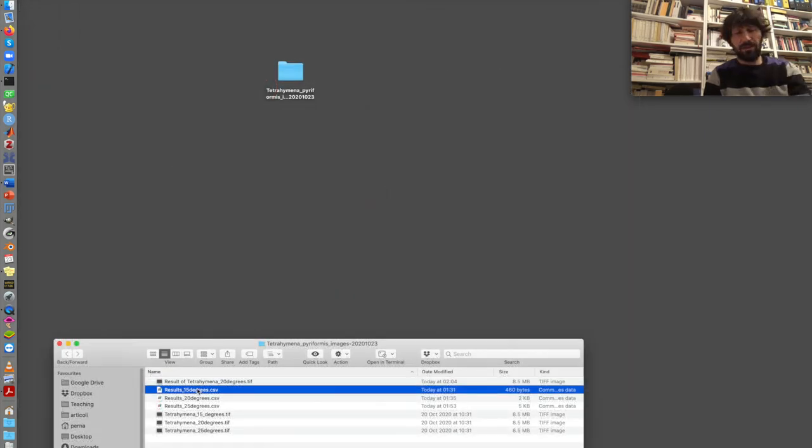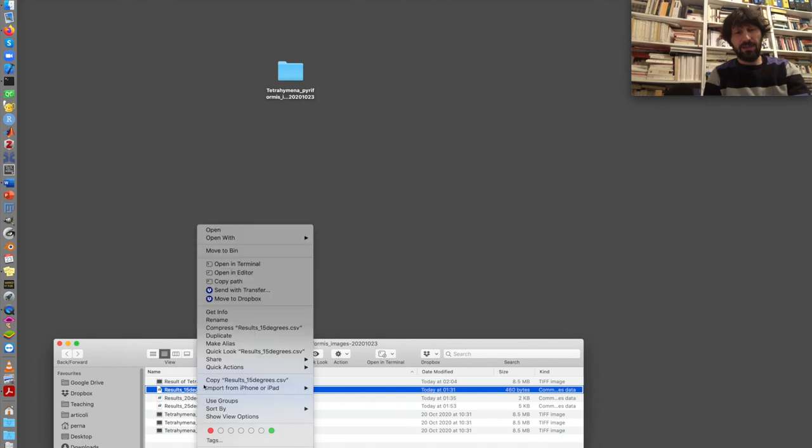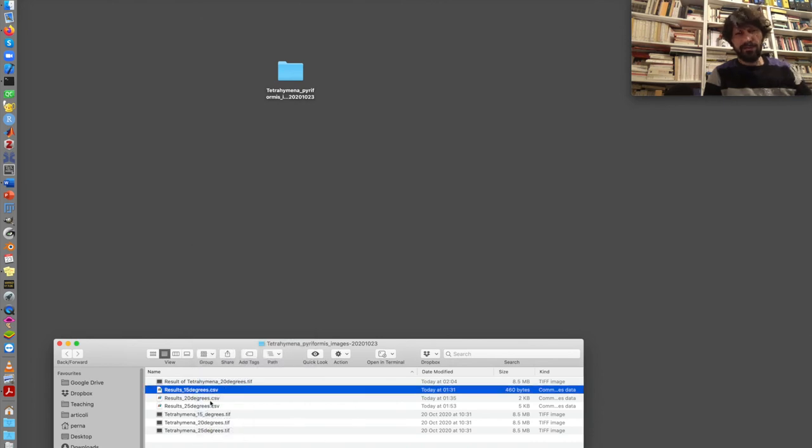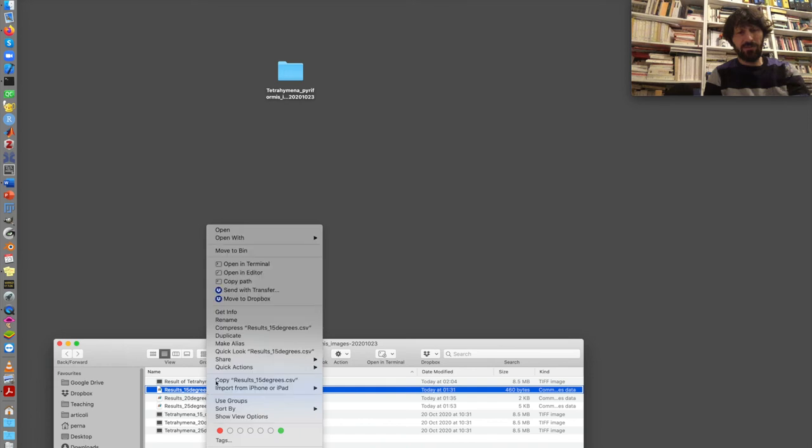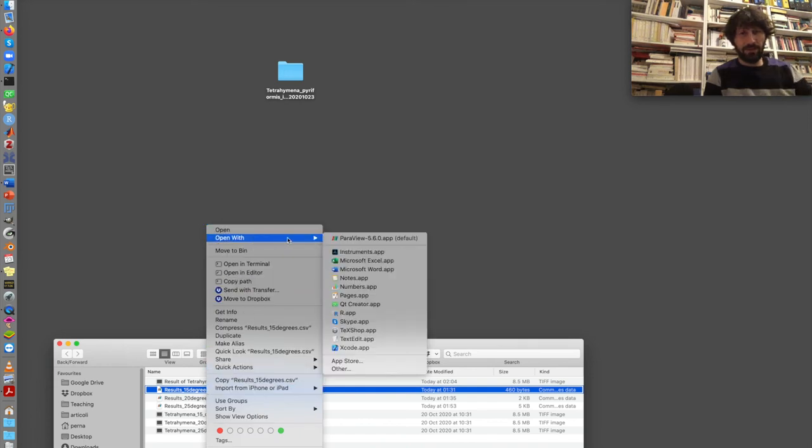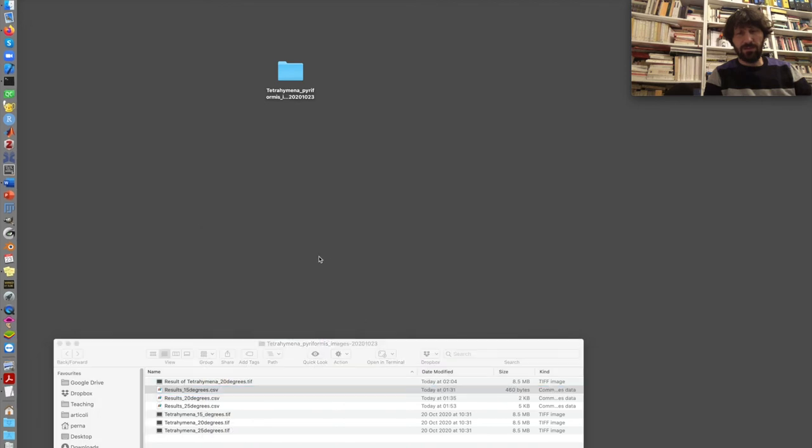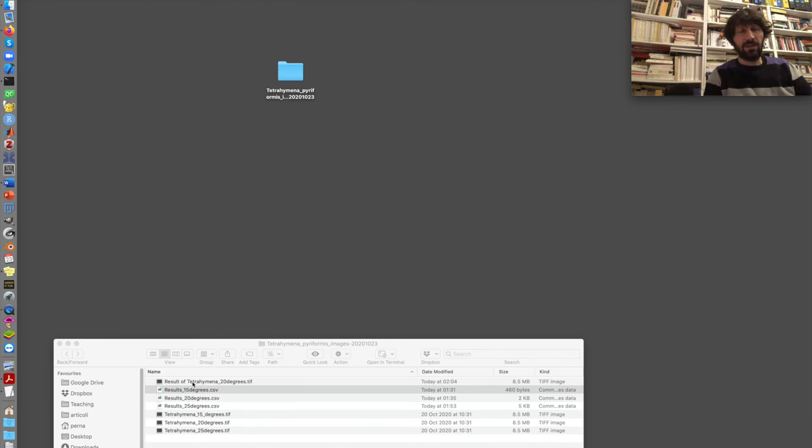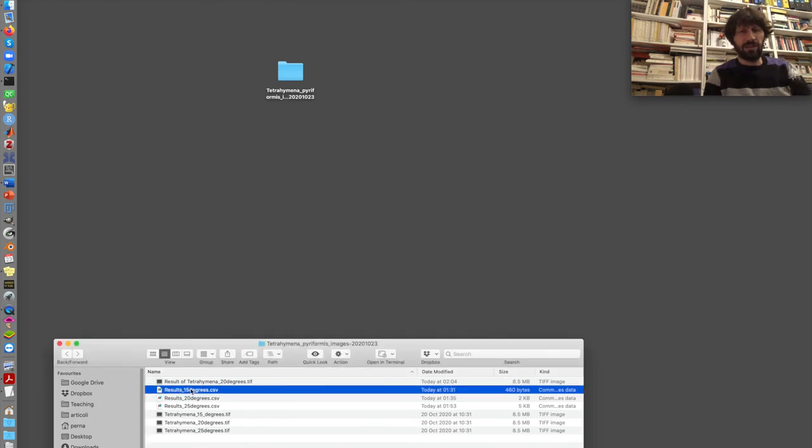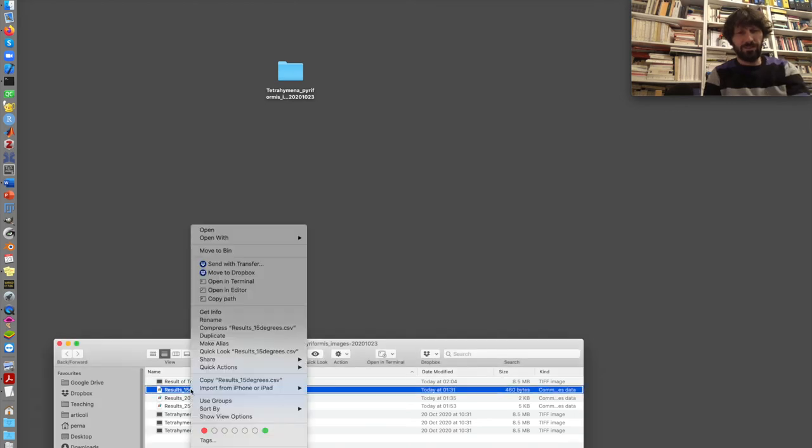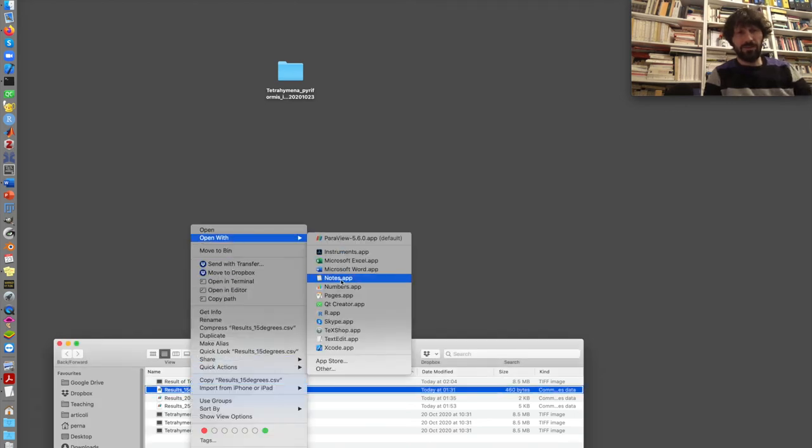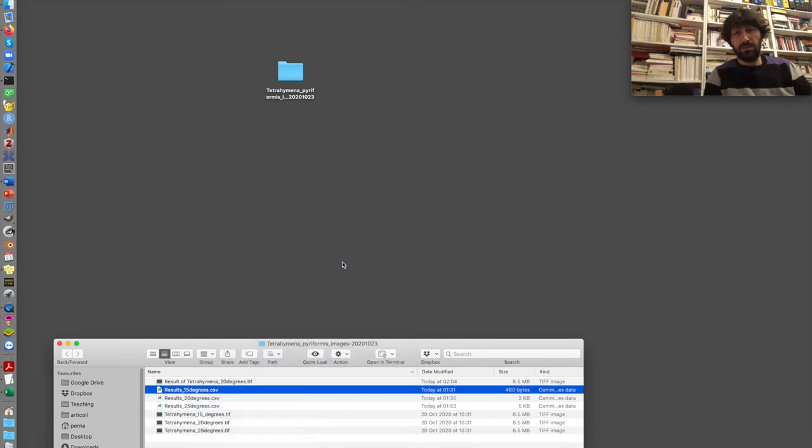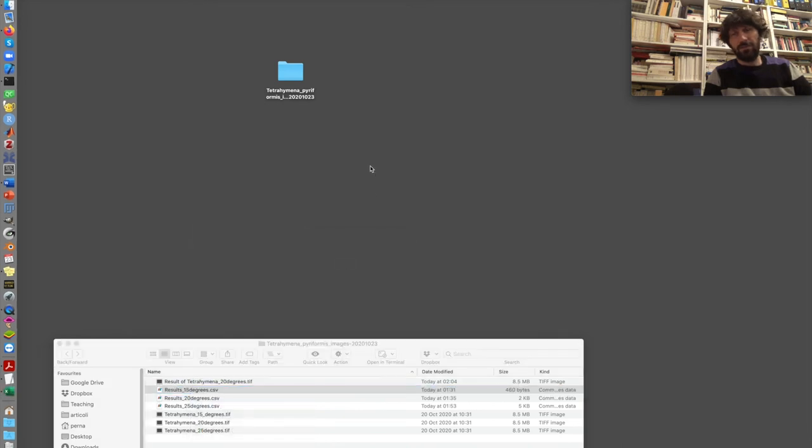The results are these three CSV files, which are here. I can open them with a text editor, for instance, to see what is inside. And we see it's a CSV file with a series of header columns and then a series of numbers. In this case, I open them with Excel as well, because I need to change a few things before I can plot them.